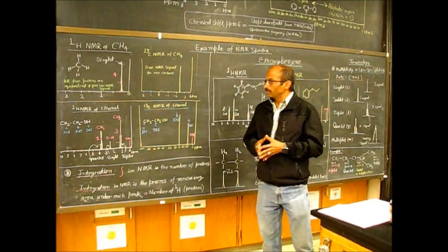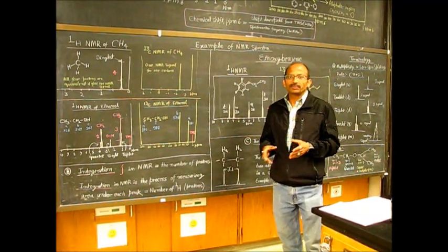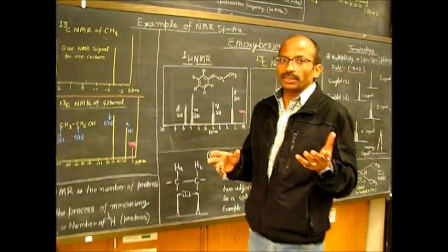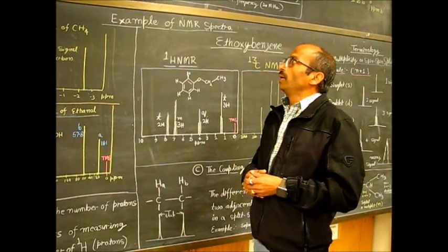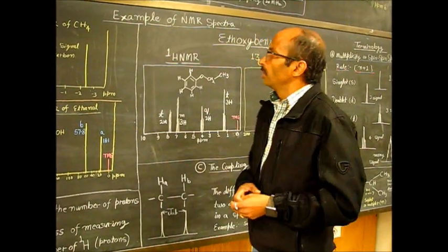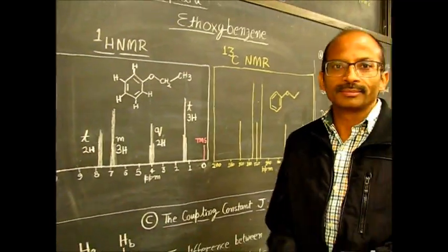Hello everyone. So welcome to experiment number 1, the NMR and IR lab. In this lab we will give you a brief introduction to NMR spectra analysis, how you interpret proton NMR and carbon NMR, and what terminologies are involved. The deeper theory you will study from your lab manual or some other videos. So let's start from nuclear magnetic resonance spectroscopy.